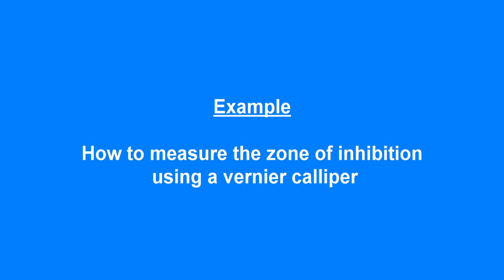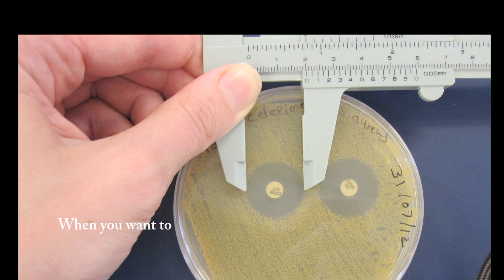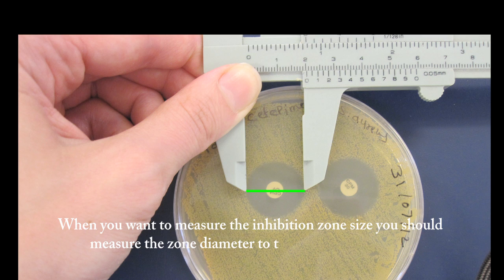How to measure the zone of inhibition using a vernier caliper. When you want to measure the inhibition zone size, you should measure the zone diameter to the edge of the growth.